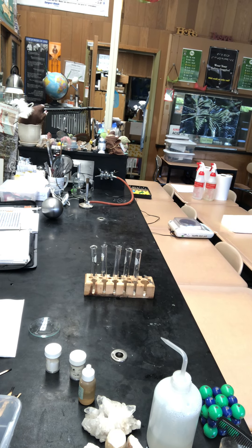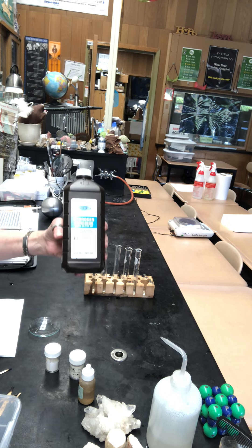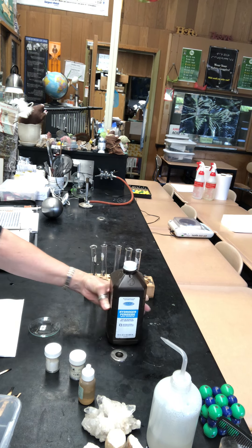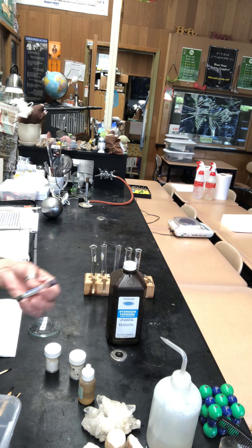Reaction number three involves the use of hydrogen peroxide. This is 3% hydrogen peroxide which most people can get at their house.